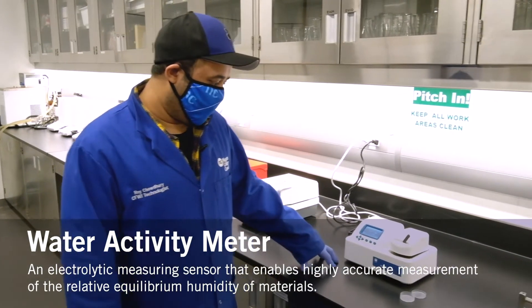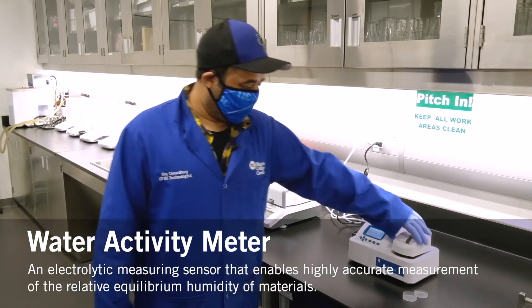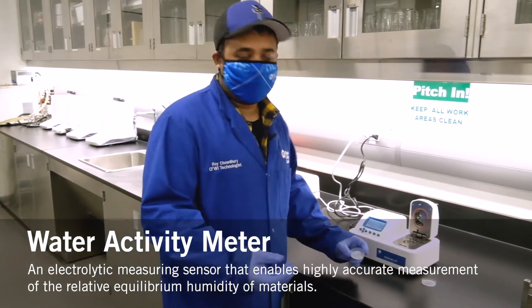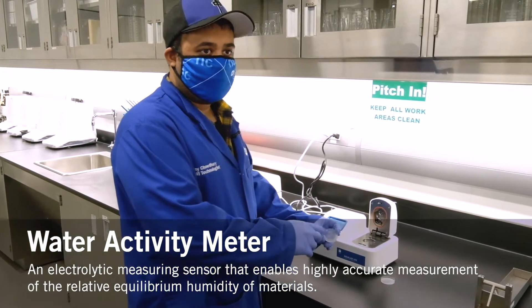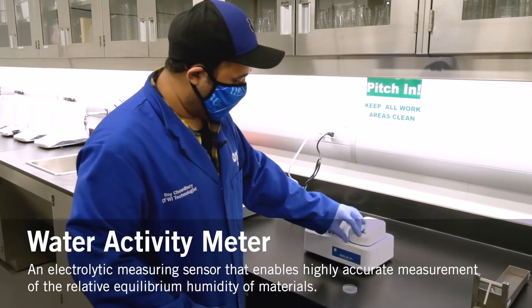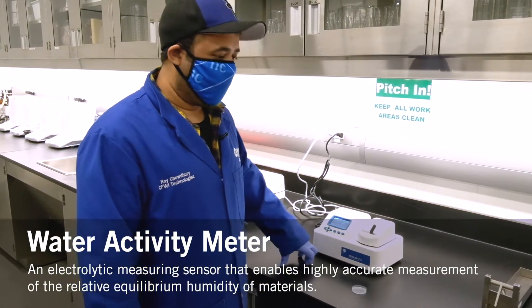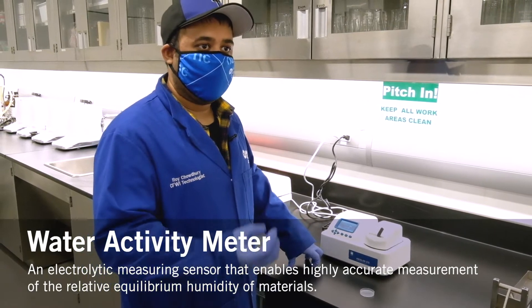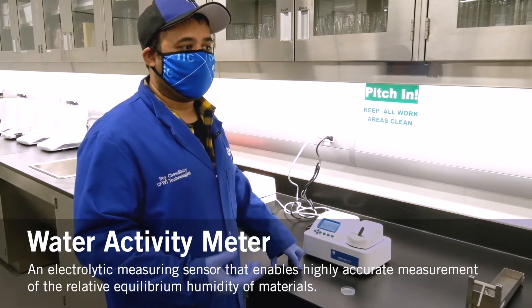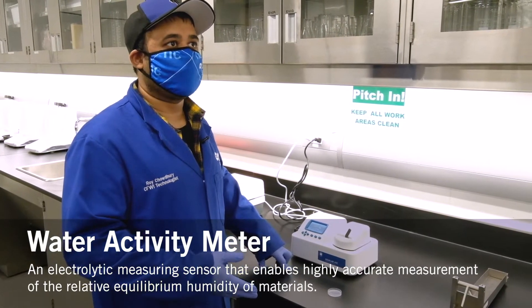The next equipment is a water activity meter. Basically it measures the water present in a food substance. For example, if you're testing cookies, you just place the sample in the sample cup, and after a minute or so it gives you a reading of the moisture content present in the food product. It gives you an idea of how perishable it is and how prone it is to spoilage.